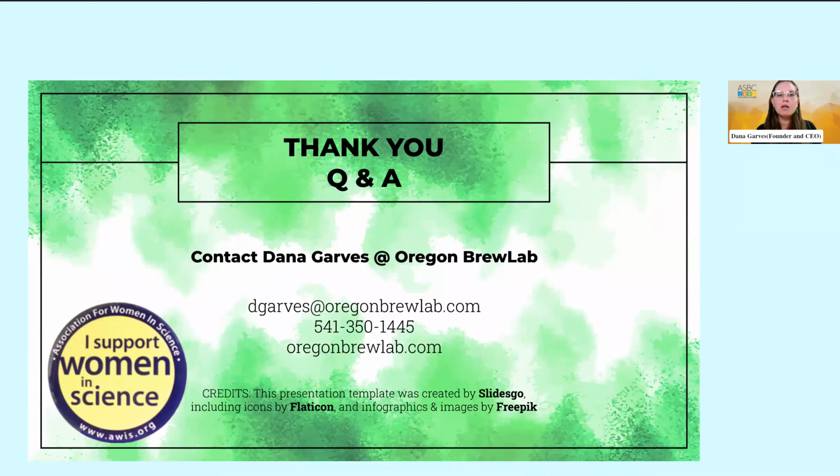And so I wish that I had better recommendations for you, but please check out that MBAA resource that I posted. They have some really good ideas about what to do when you reuse isooctane.